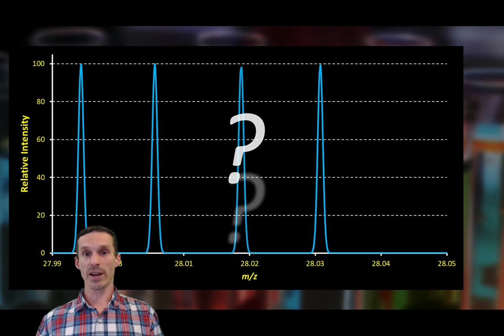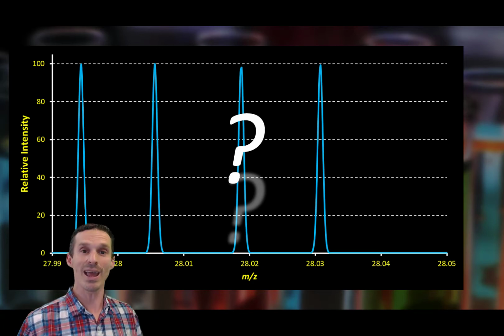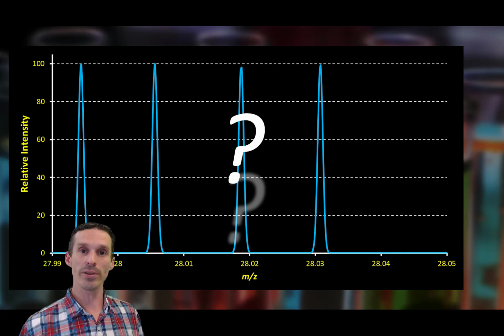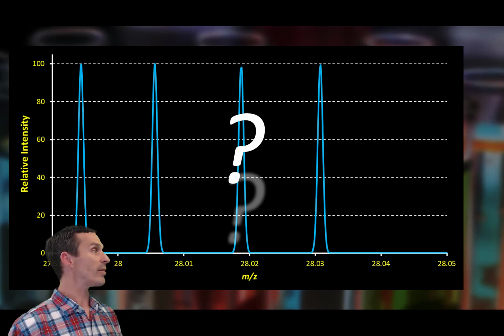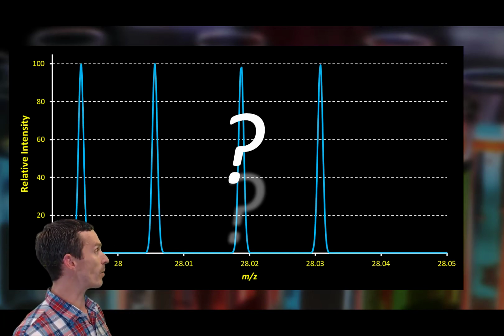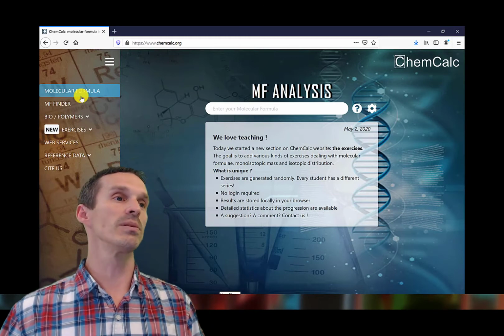Now I'm just curious if anybody's picked up on this, but of that mass 28, yeah, H28 is not a reasonable molecule, but there is another reasonable molecule that we could put down that I think you could draw a nice structure for. There is a compound that has a mass of 28. I'm just curious if you might be able to figure out what that is, maybe from the mass that I'm reporting here.